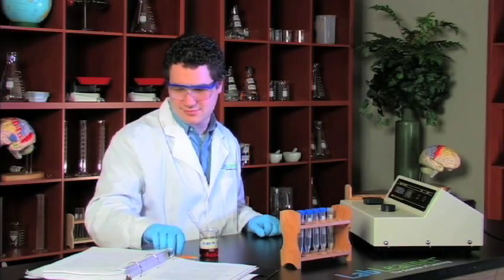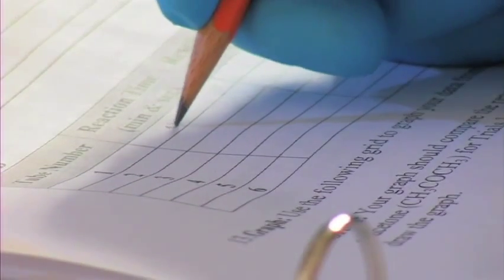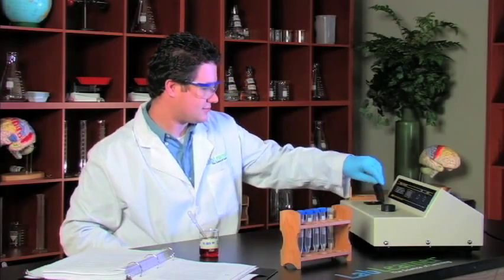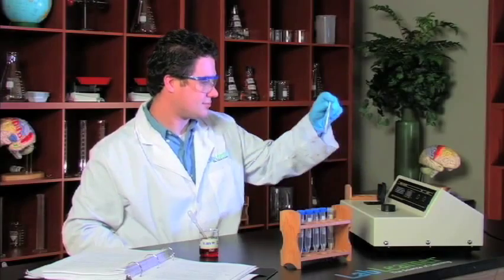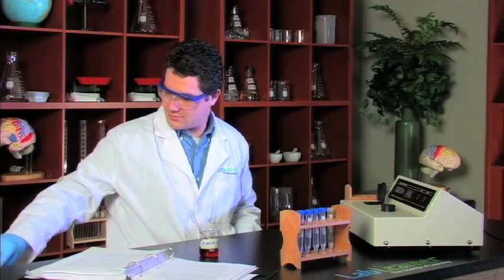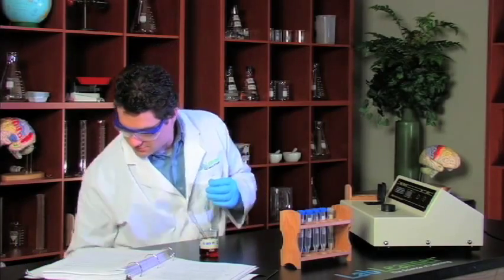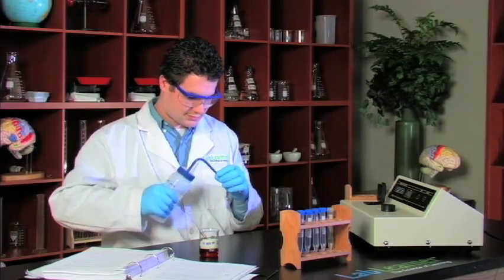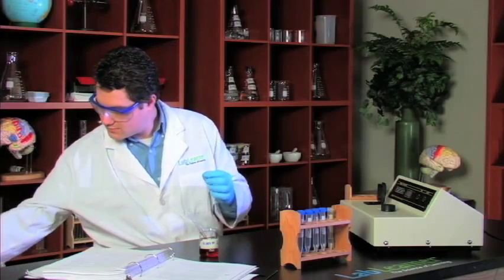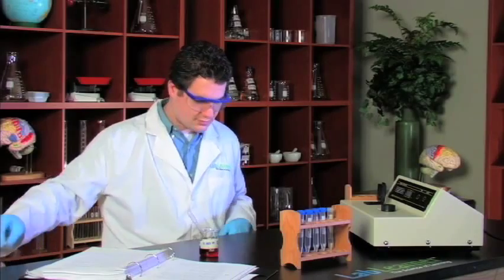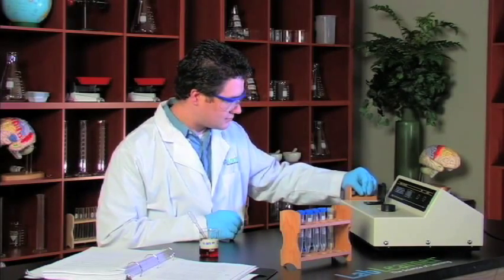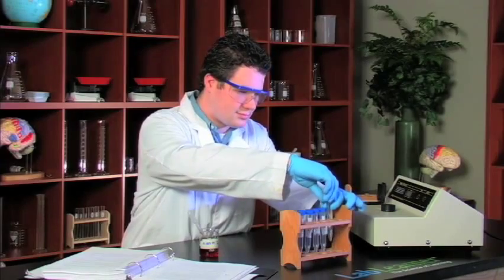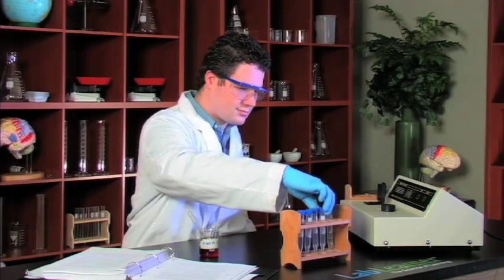And here we come, and so he stops the stopwatch and we're going to record the amount of time that it took in reaction number one or tube number one for all the iodine to be used up. With that reading we empty out the cuvette, rinse it out with water, and we'll get ready for the next reaction. He resets the stopwatch so he's ready to do tube number two.